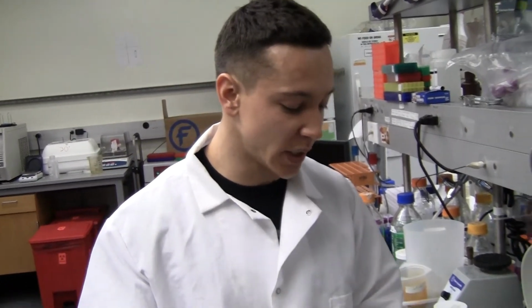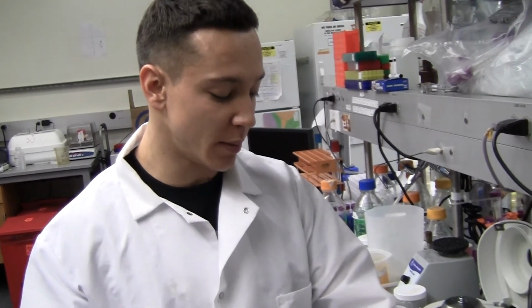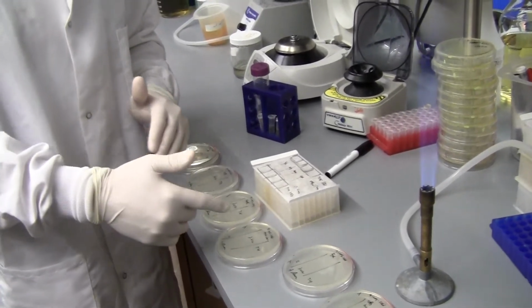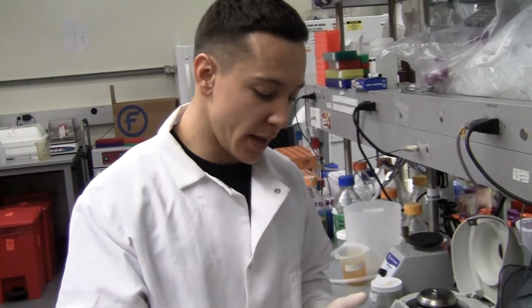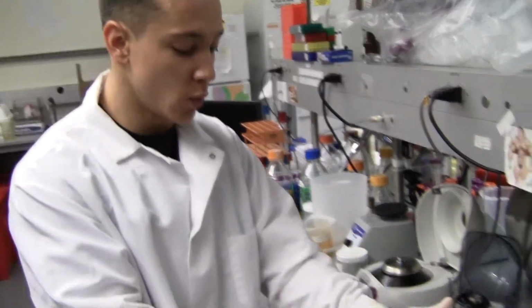And to test this, since I said this is under an inducible plasmid, I'm going to be putting these E. coli on these plates, like an even spread, and then I'm going to be making a serial dilution of my T4. That means in our T4 lysate we have something like 10 to the 9th different particles of T4. And then we're going to do a 10-fold serial dilution.